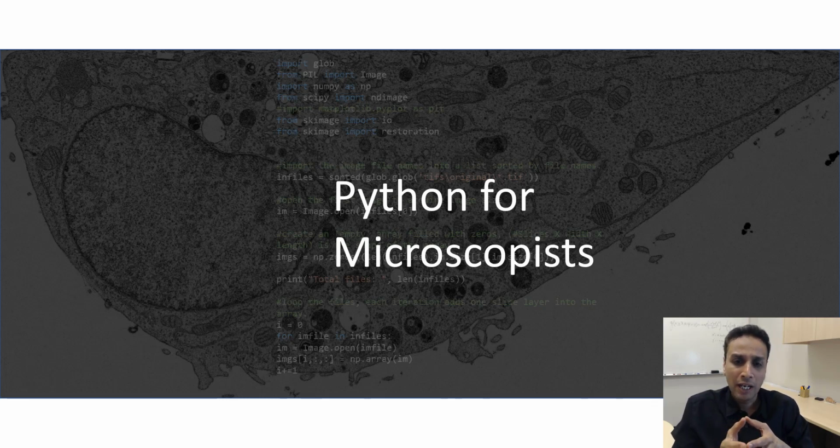If you have different regions, let's say with different texture, but the mean gray level is pretty much the same, then there is no way you can do this. In fact, you have to use some sort of pre-processing, some texture-based region identification, maybe an entropy filter, or some of those filters to separate the regions before you can do histogram-based segmentation. Sometimes you may even have to use machine learning to segment your images.